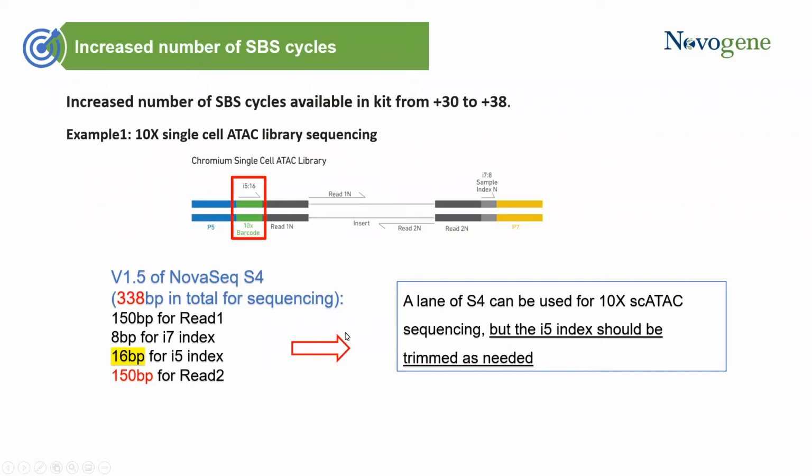So here we can accommodate greater cycles, which will allow for even greater demultiplexing power. If you can extend your indice length, you can create more diversity and more potential for individuality of your inserts.